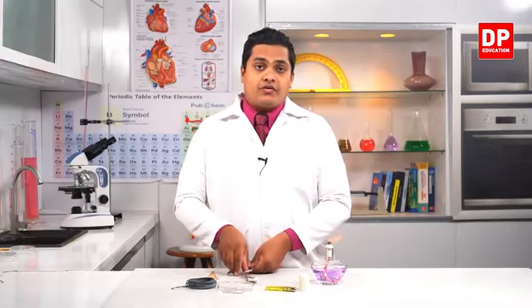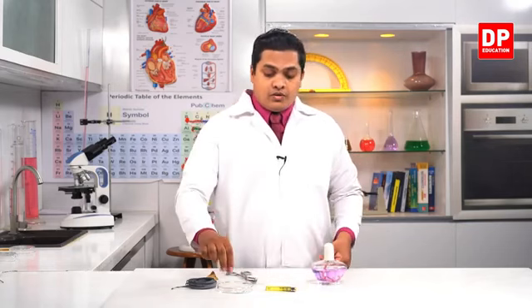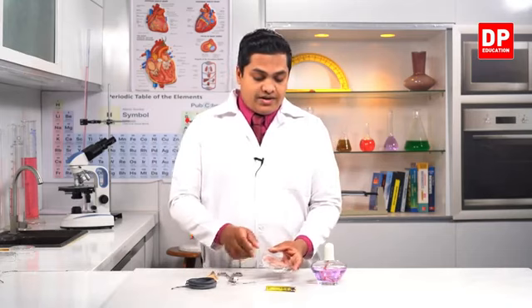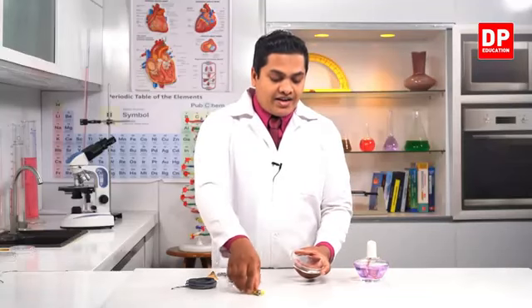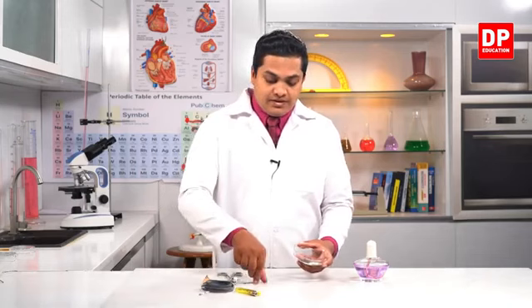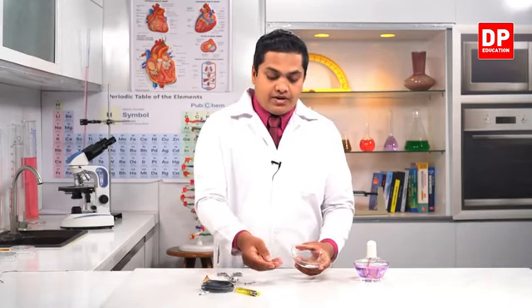Right, my dear children, now you have observed what happens when you burn a piece of magnesium like this. So let's see that hard nature of magnesium. Now this is a magnesium piece which I have prepared.